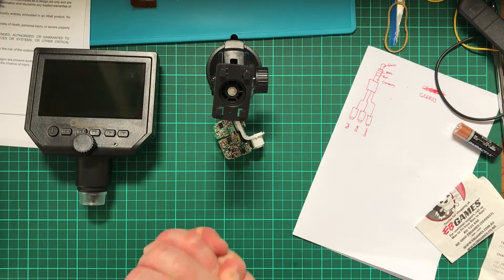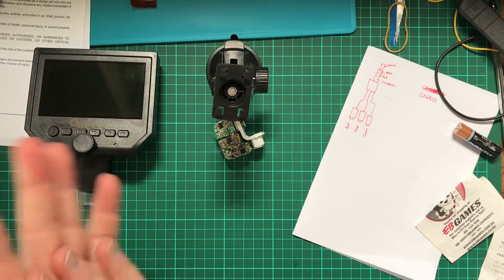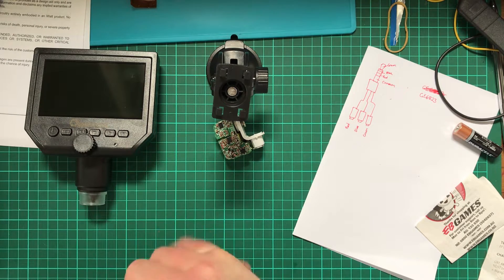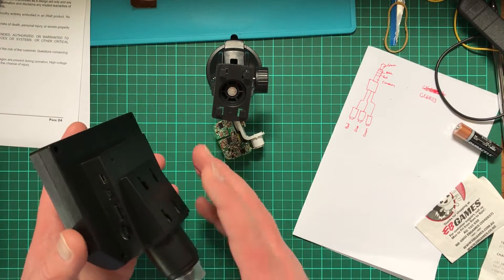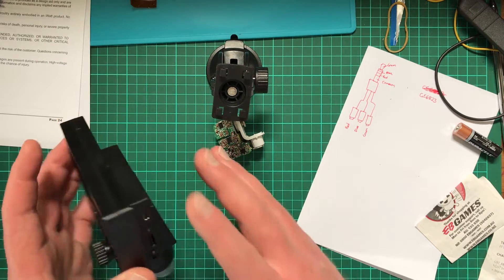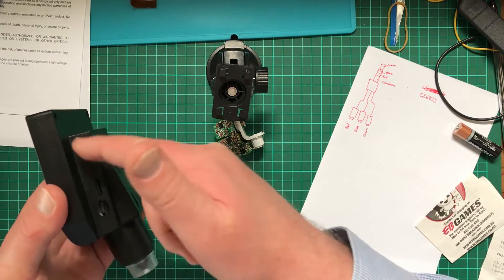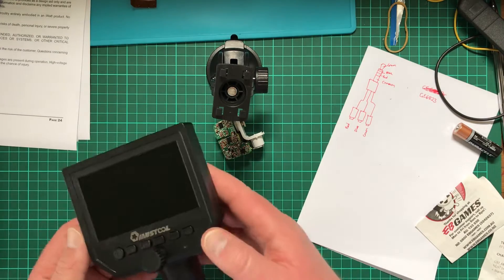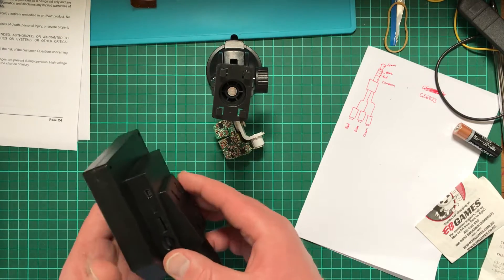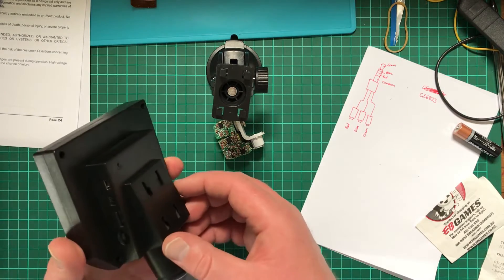Overall, I'd say it was well worth the purchase, but if you are doing something on a regular basis this is definitely going to work for you. I haven't really used it all that much, so I haven't had to replace the battery yet. The battery life does seem acceptable, but the mount would allow you to run a USB cable through it and plug it in, so you could run it off the wall. I tossed out the charger that came with it and I'm using a mobile phone charger I picked up in an op shop some time ago.